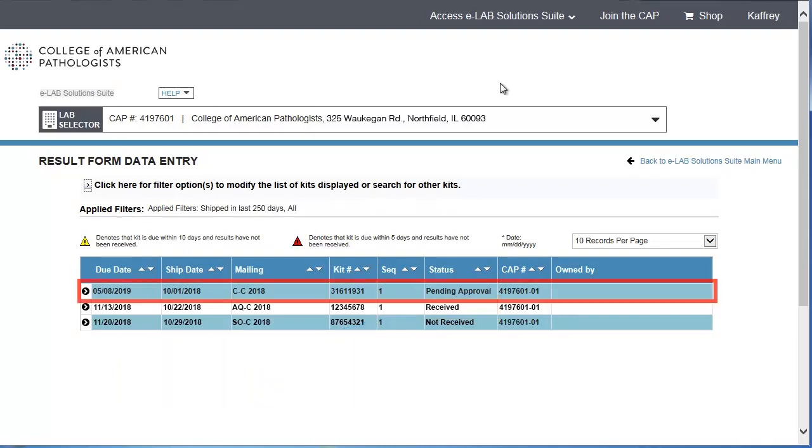In this example, one kit is pending approval. To review and approve all the pages within that kit, verify the kit number, then click the row.